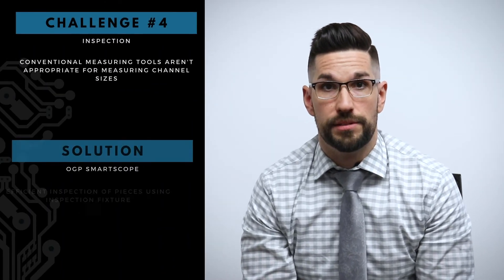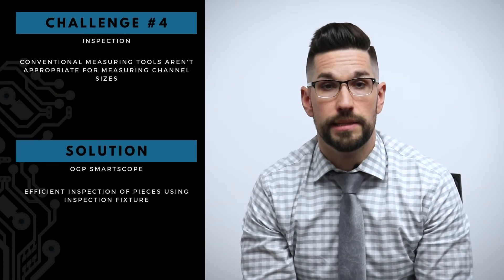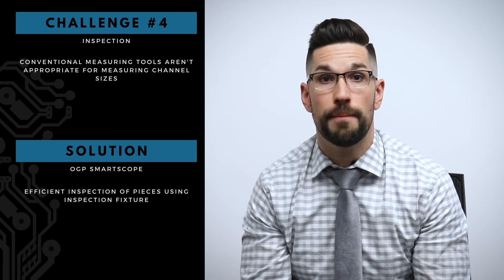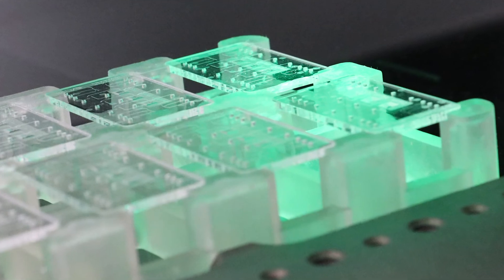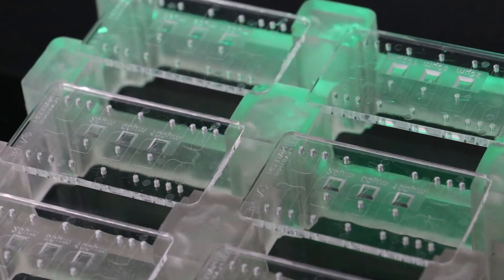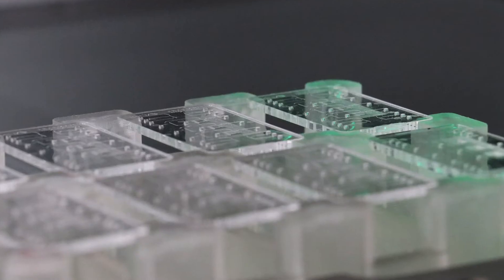So what we ended up getting was an OGP smart scope, which has the capability to zoom down to many times what your eyeball can see. And we're able to inspect a number of pieces at a given time using an inspection fixture. And what we found was that not only were we able to mold channels that were down to 25 microns in channel width, but also hold a tolerance of plus or minus three microns, which is an unbelievable feat.